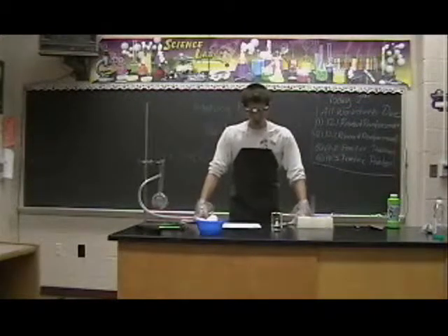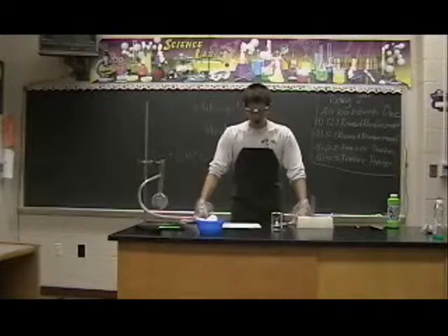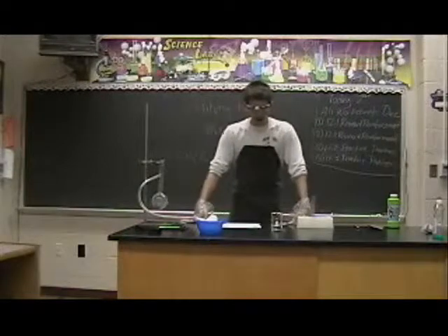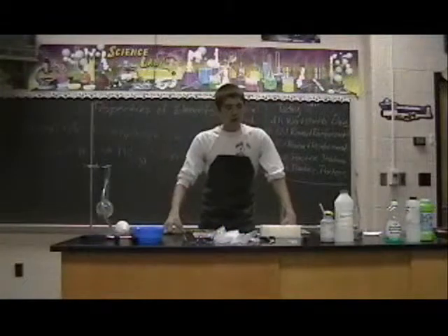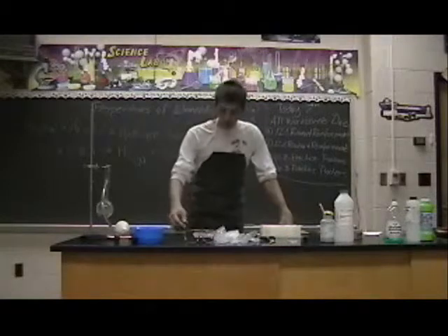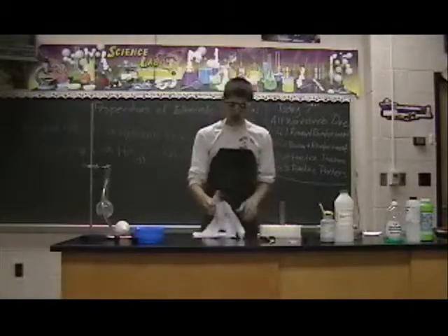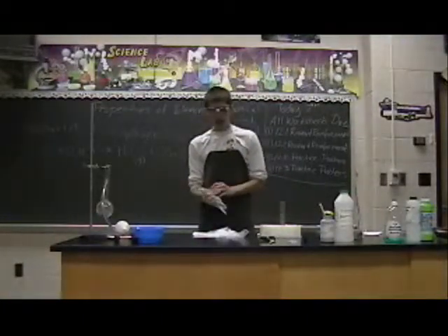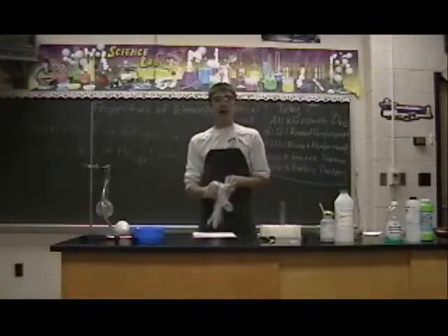Some questions are: why was the Hindenburg filled with hydrogen? Another one is, would another gas have been better? In this lab, you will make hydrogen gas and investigate its properties so that you can answer these questions. The materials that will be used in this laboratory project are chemical splash goggles, a laboratory apron, which is already on, and latex gloves, which do not have to be actual latex, they can be plastic, anything to prevent your fingers from getting splashed by hydrochloric acid that could burn you.